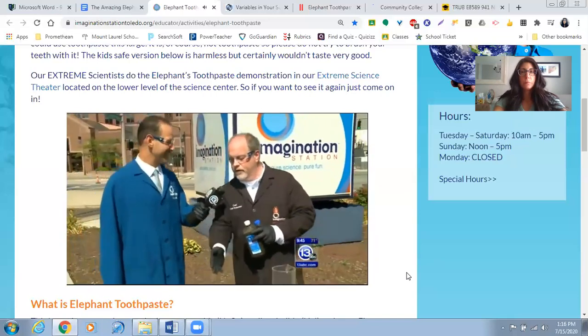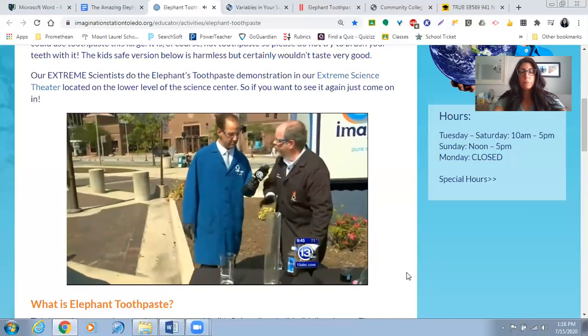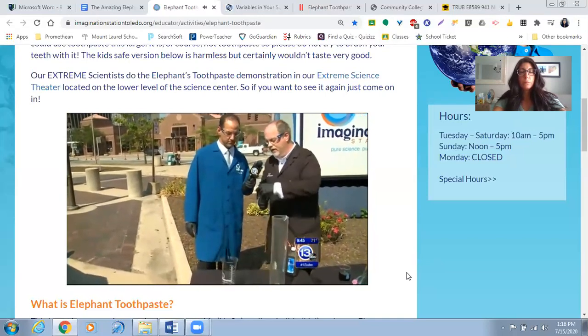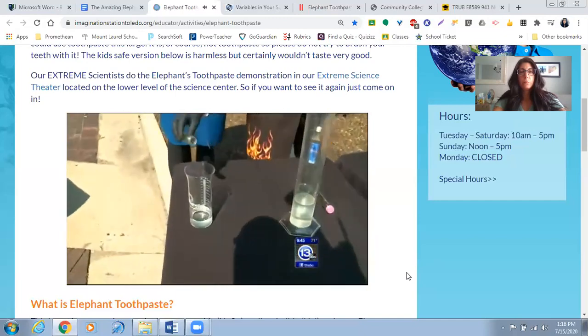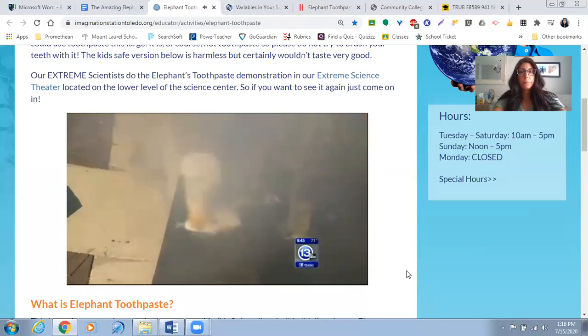So this is just a bigger scale version. This here is 3% hydrogen peroxide. What we're using over here is 35. So it's much more concentrated. I have a catalyst in here, sodium iodide, and we're going to pour that into the hydrogen peroxide just to see what happens. Okay? Sure. Because it should catalyze it and cause it to break down. So I'll pour a little in. Just see. Step back. Whoa. Yeah. Catalyzed all over. And look at that steam, right?